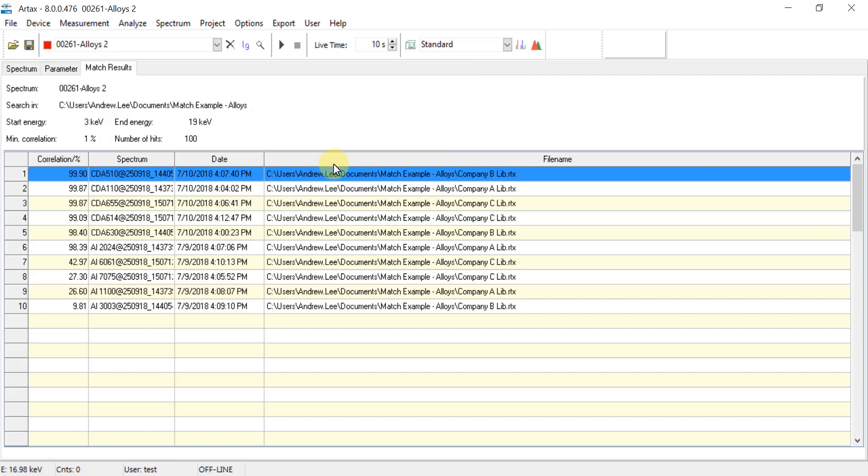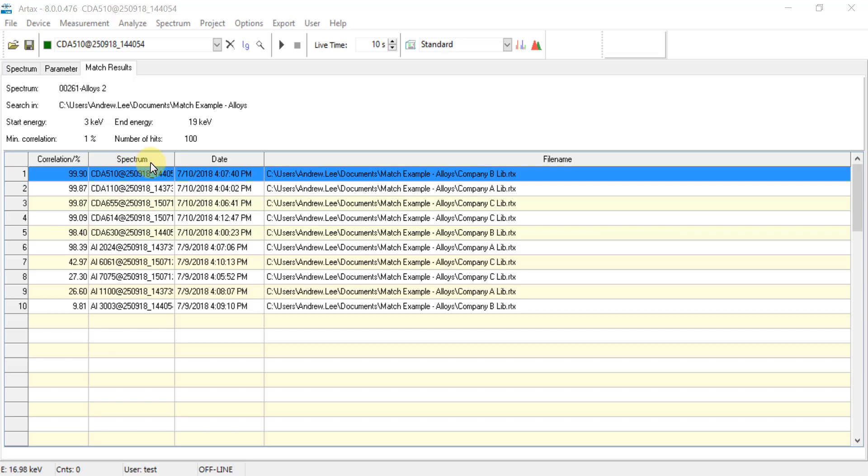The results are now shown in the Match Results tab in order of their correlation percent. Based on how I chose to name these files, the column labeled Spectrum will show the specific alloy ID designation, and then the column labeled File Name will show the source or company. So for this example the first match is for alloy CDA510 from company B with a correlation of 99.9%.